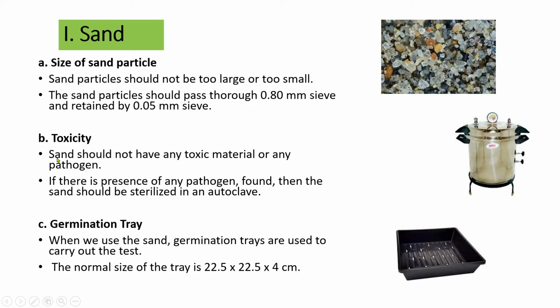Then coming to toxicity. Sand should not have any toxic material or any pathogen or any nematodes. And if there is any presence of such, it has to be sterilized with an autoclave or any other methods.